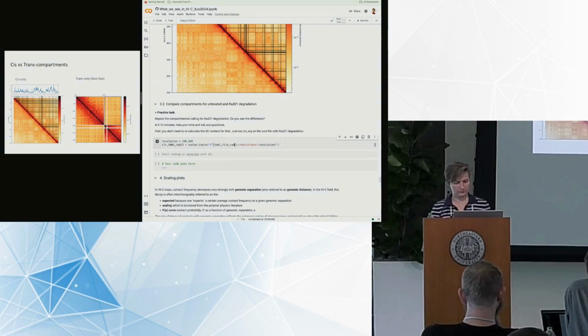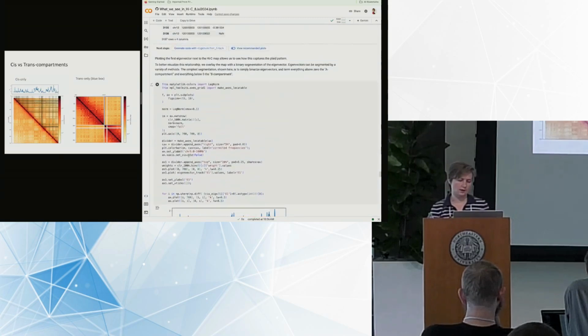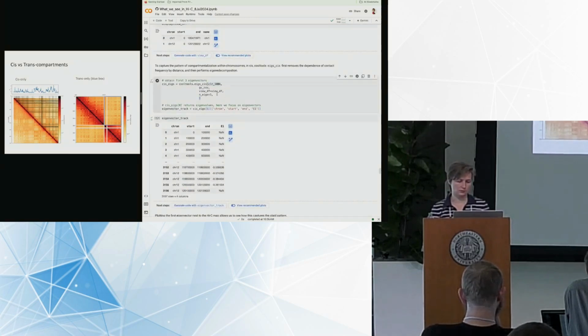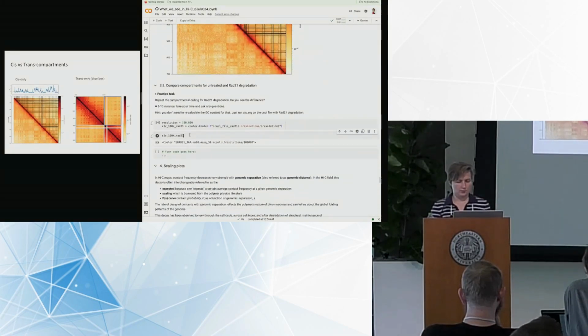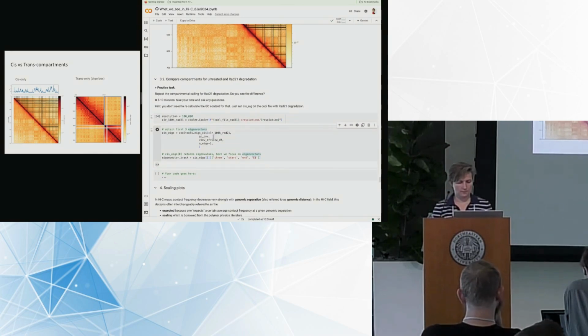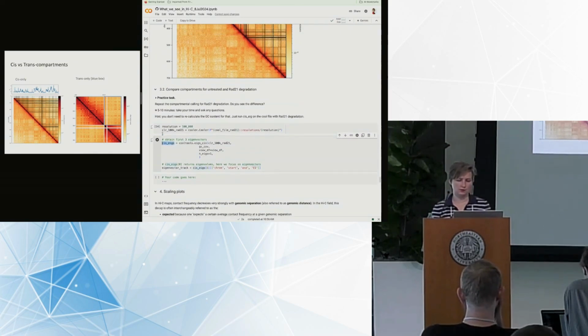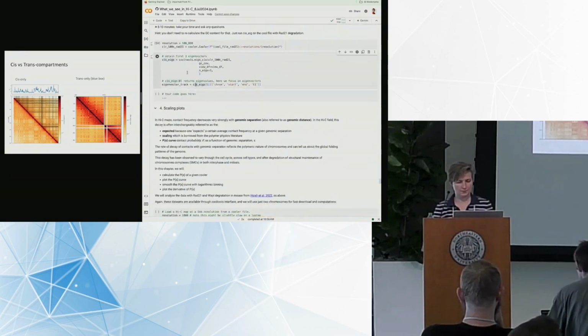And you can see that the file was read all right. So it's a proper cooler object. Now I need to run eigendecomposition on it, so I will use this code with a simple cooltools function, and I just need to replace the name of the file with RAD21. So these are now the eigenvectors for the RAD21 data. Let's try to visualize it.